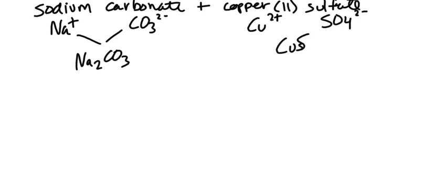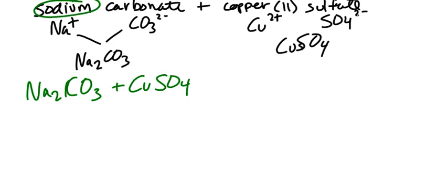I'm going to put them together in a reaction. So I have sodium carbonate plus copper sulfate. During precipitation reaction I have a cation and anion for both my reactants, I just switch places. So it'll be sodium sulfate as one of my products and the other product will be copper carbonate.